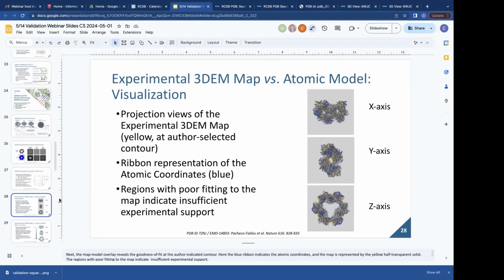I'll take that question. It's another very good question, and it's a bit difficult to answer without having the details behind the problem, other than to say that there could be at least a few different reasons that cause issues with fitting. It could be that there are significant issues with the starting model that's being used to dock or fit into the density. If you have a starting model that is not very well predicted, you can try putting that in the map and it's just a very bad fit, and it's hard then to lock onto a better solution. I think you can also have significant regions within the map itself where the density is poorly resolved, and it can reach the point that it prevents achieving a good overall fit, or perhaps it's a local fit for a certain component, due to flexibility or disorder. It's just very difficult, even in a well-resolved structure, to achieve a fit. Thanks.